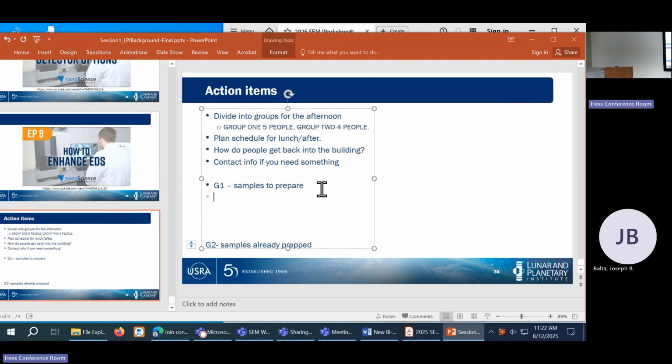My guess is you don't want these coated by anything, right? So these may be a variable pressure kind of thing. She already has them on tabs.